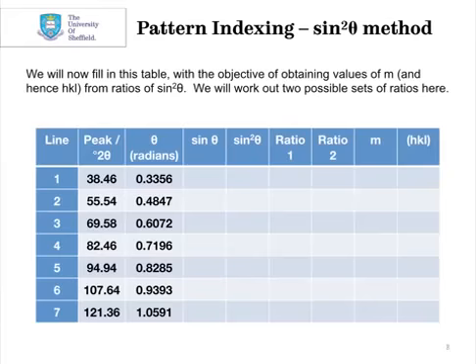So the first thing, we're going to do the sine squared theta method. This is the table that we need to fill in to do this. The ultimate objective is to fill in the m column on the right hand side, and from that we can calculate the HKL values. So I've filled in here 2 columns already.